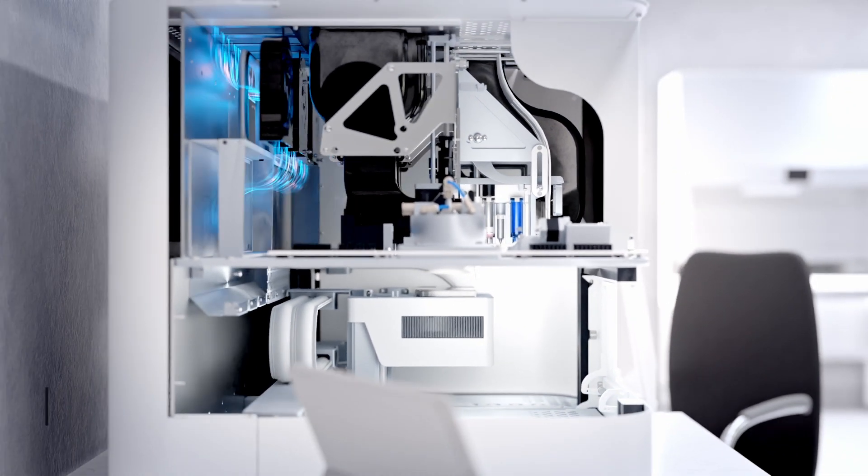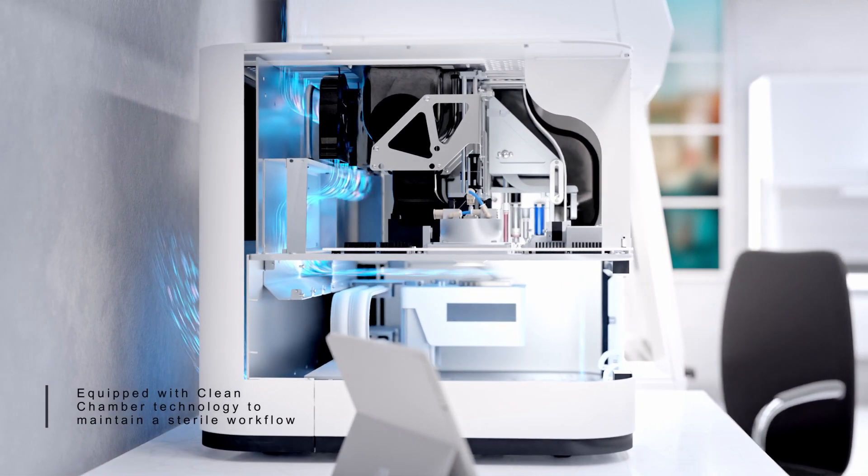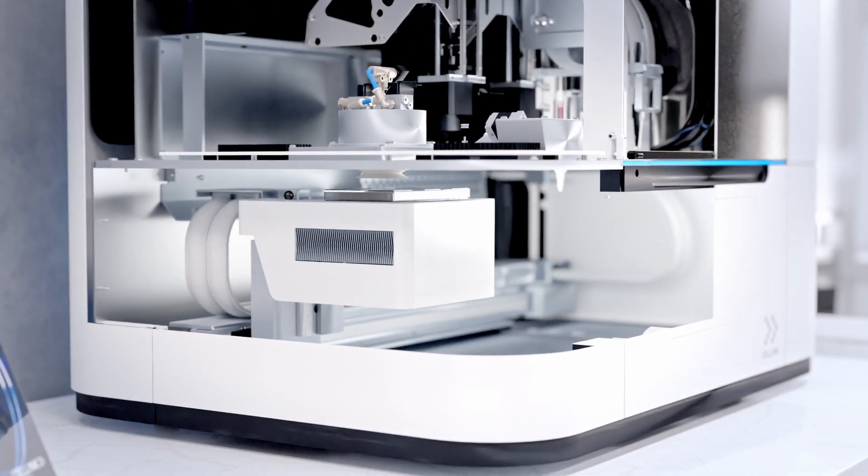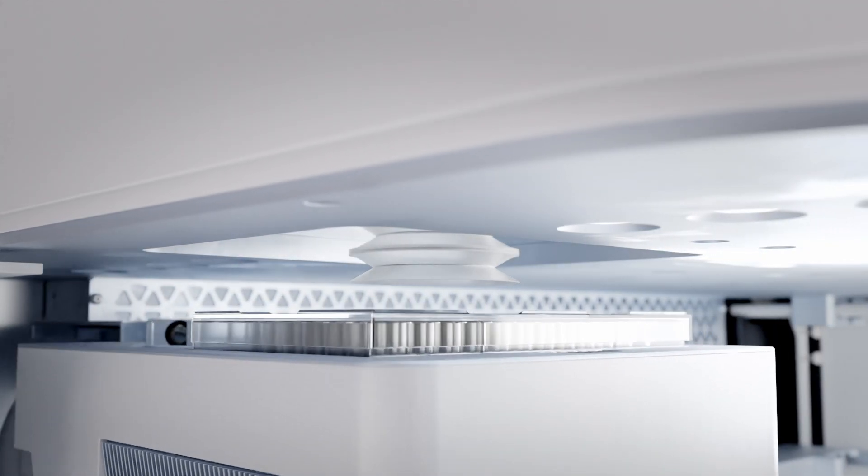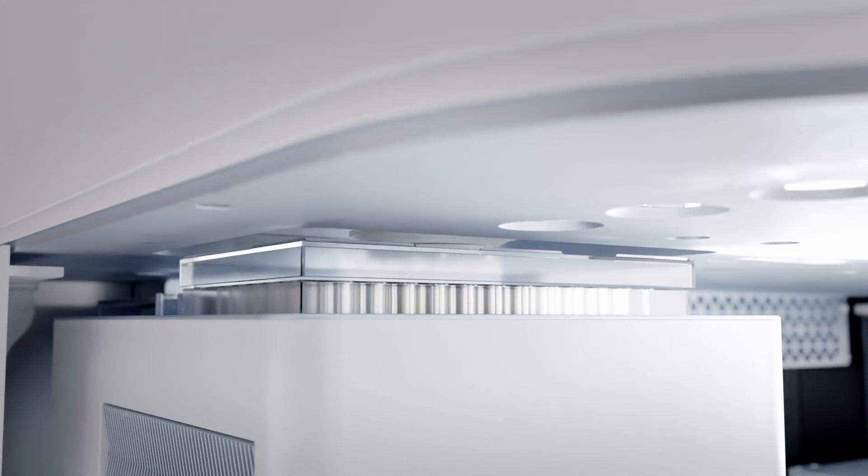Extending Cellink's patented clean chamber technology, the BioCellX is equipped with HEPA filters and UV sterilization, ensuring a completely sterile environment within the benchtop solution.